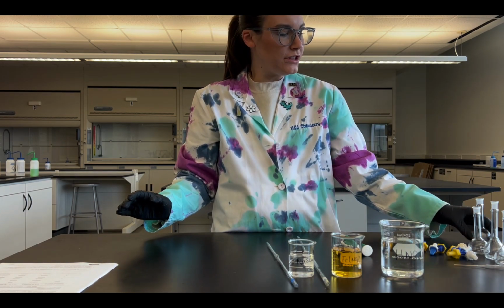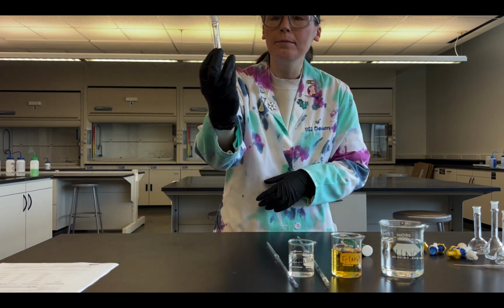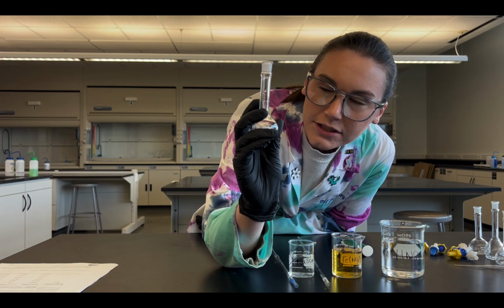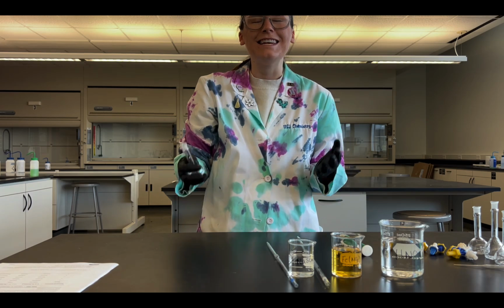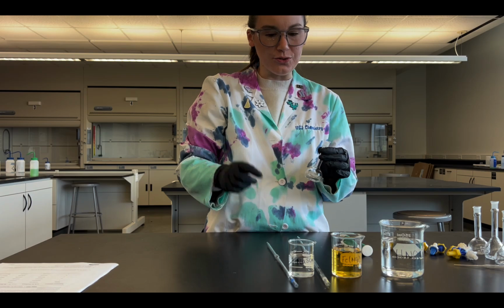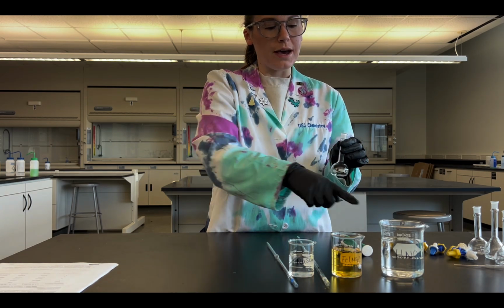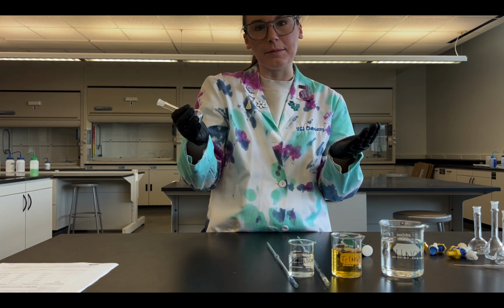Now, I'm going to make each of these solutions in a volumetric flask. These flasks are made to be exactly a specific volume. I don't know if you can see it, but there's a little line, my black glove will help show it off. When I raise my solution up to that line, I know that it is exactly 25 milliliters. So essentially what I'm going to do is put my different volumes of each solution into this volumetric flask. I'm then going to dilute it with my nitric acid all the way up to that line, and mix it up in order to make my solution.